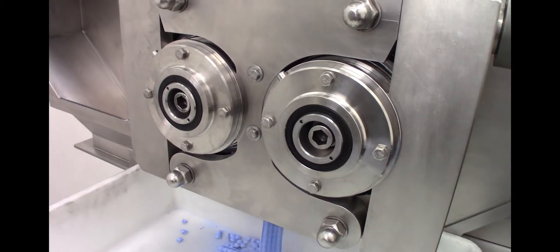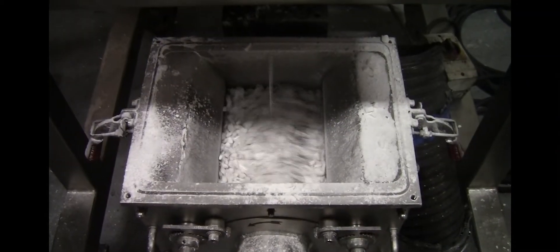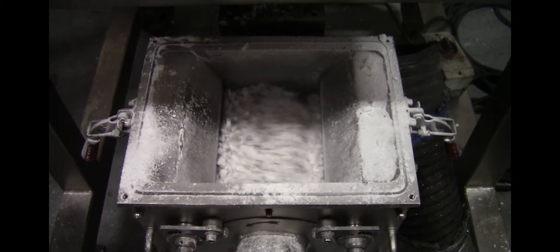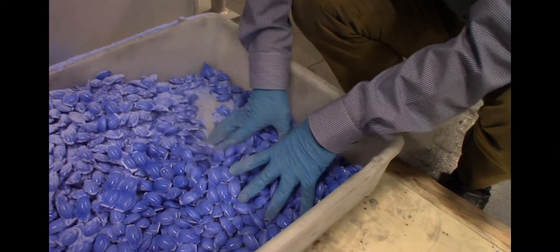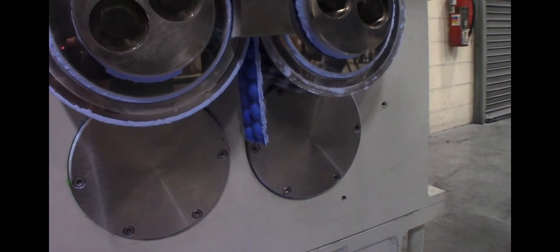Hosokawa offers a wide range of briquette systems and dry granulation technologies for the chemical, pharmaceutical, and mineral industries. Contact Hosokawa to learn how these technologies can improve your operation.